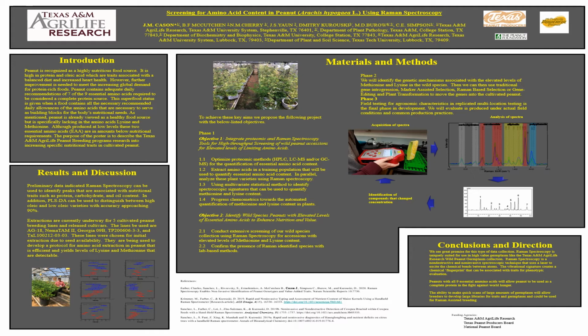Raman spectroscopy is uniquely suited for use in high-value germplasm like that in our wild species collection. It is non-destructive and non-invasive, and it uses a laser light to excite the chemical bonds between the atoms, and then this vibrational signature creates a chemical fingerprint that can be associated with traits for phenotypic evaluation.